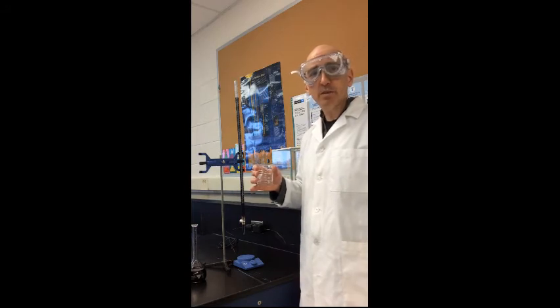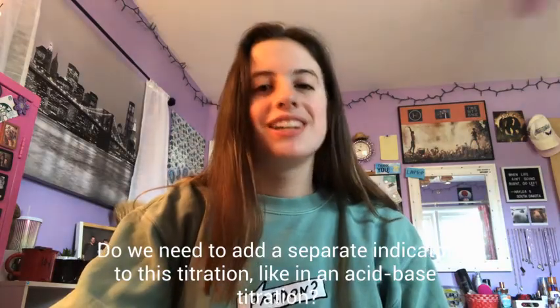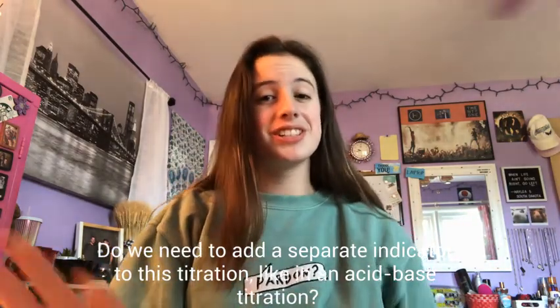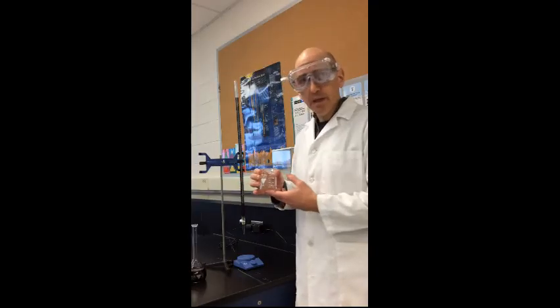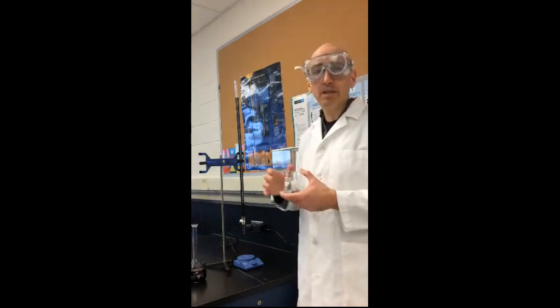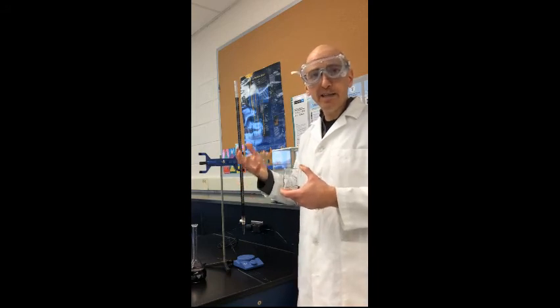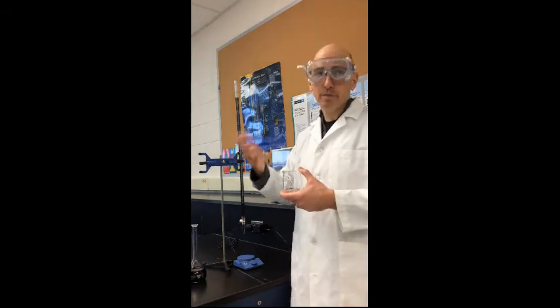Looks like we have a question from a student. Do we need to add a separate indicator for this titration, like in an acid and base titration? That's a great question. Yeah, in this case, we don't need a separate indicator. When we did acid-base titrations, you used something like phenolphthalein or bromothymol blue, an indicator to tell you when something's going from acid to base.